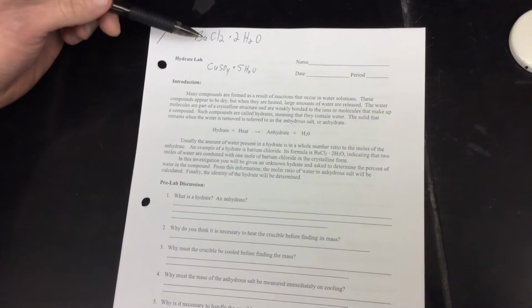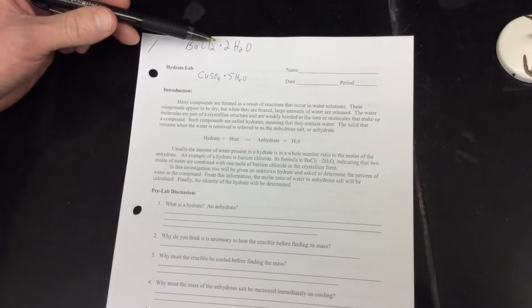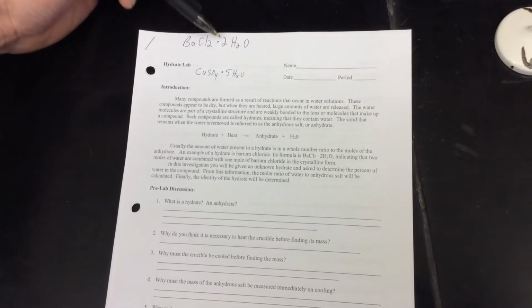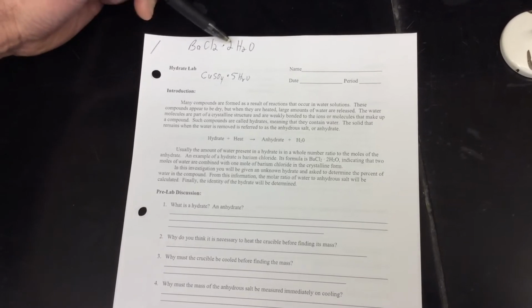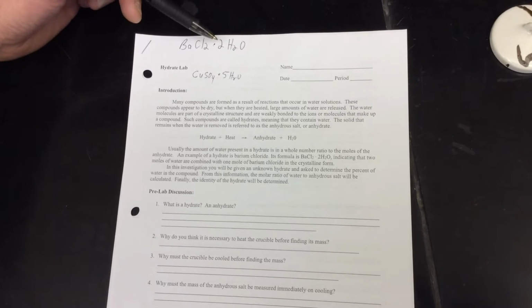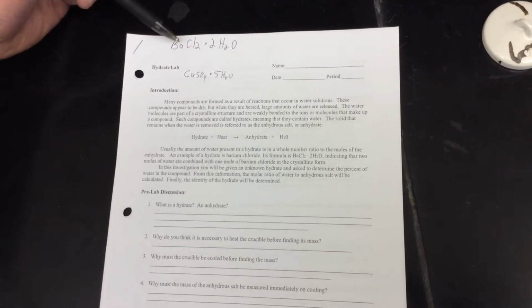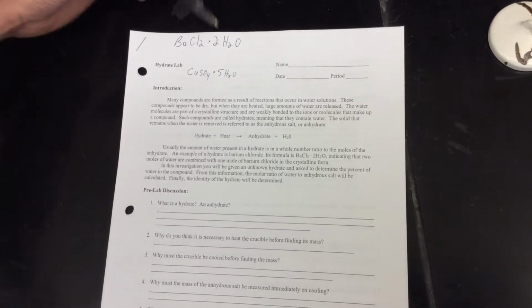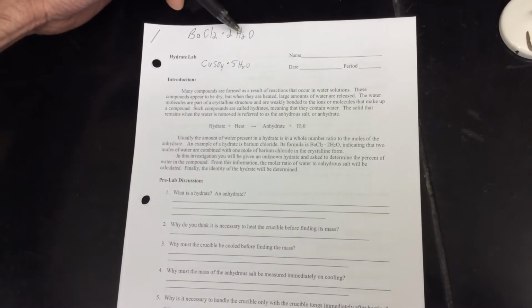What we're going to do in this lab is take some of this barium chloride dihydrate, put it into a crucible and heat it to very high temperatures to cause these water molecules to evaporate. Basically, they are going to leave the structure. And what we are going to do experimentally is calculate how much, percent-wise, water is in this whole hydrate compound. We are going to compare the percentage we get experimentally with the accepted value.